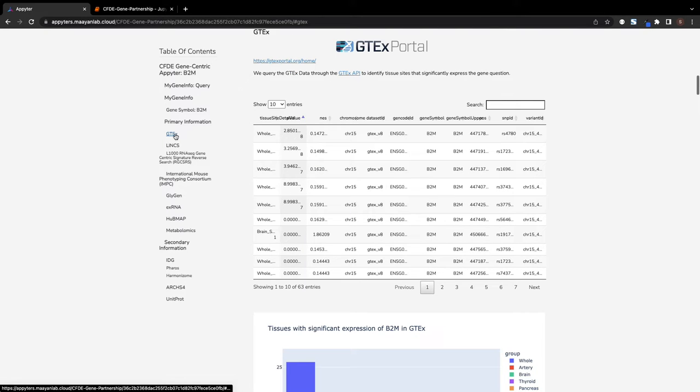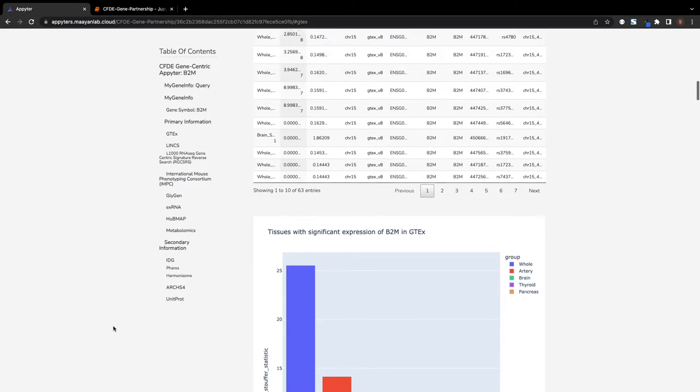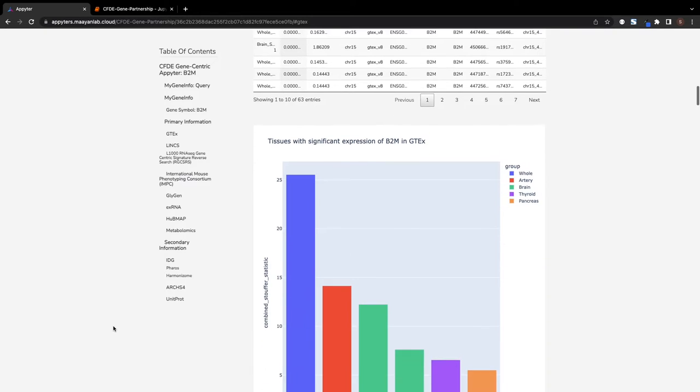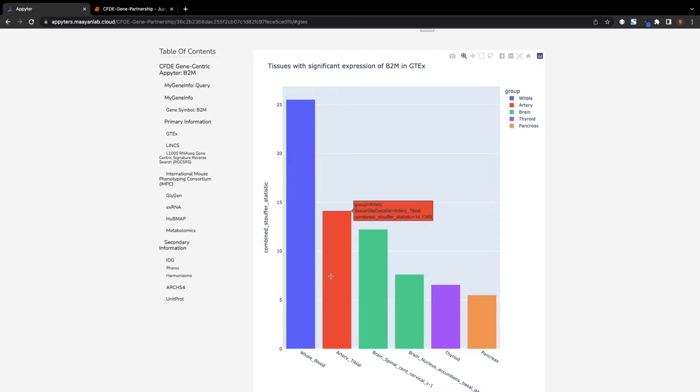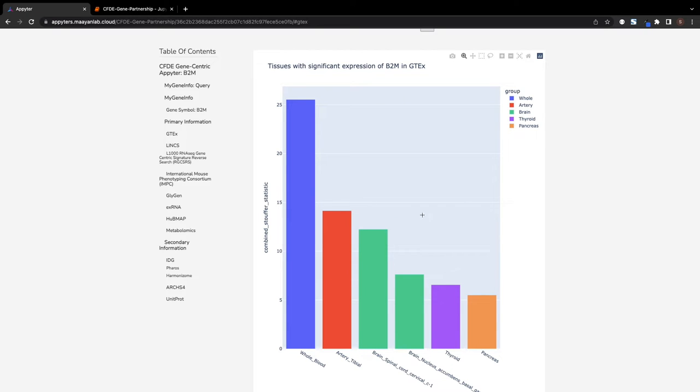First, the GTEx database, which contains non-diseased tissue-specific gene expression samples from over 50 tissues collected from about 1,000 postmortem individual donors, is queried to identify tissues where the input gene is highly expressed.